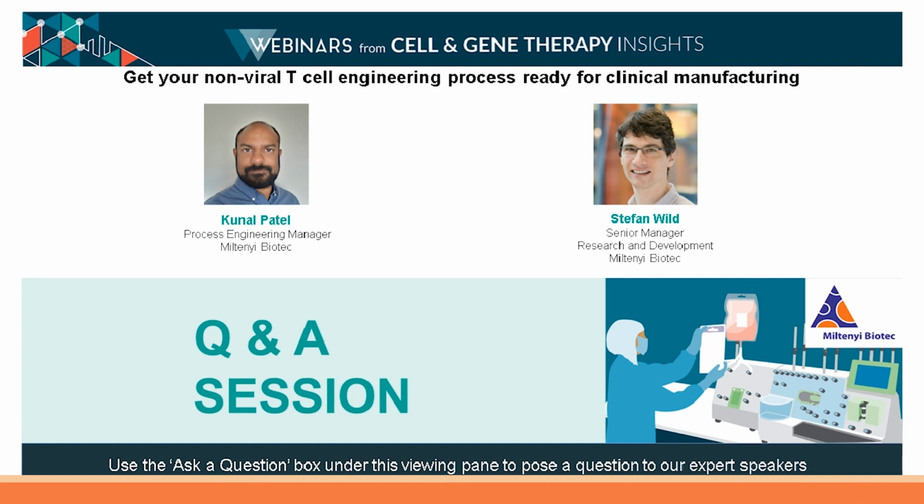Absolutely. And this one, perhaps more one for you, Kunal. What approaches would you, or what areas would you say electroporation would be most valuable for within the cell therapy field?